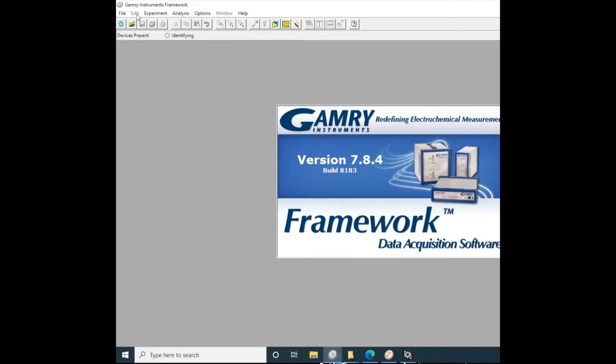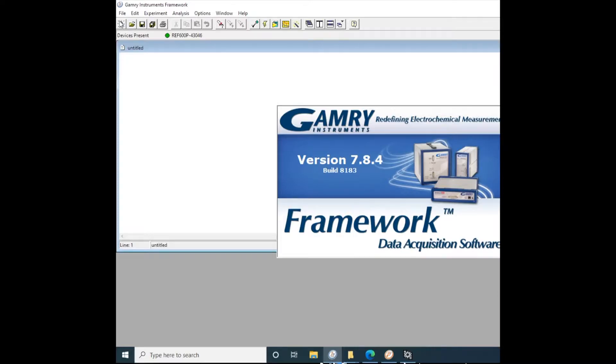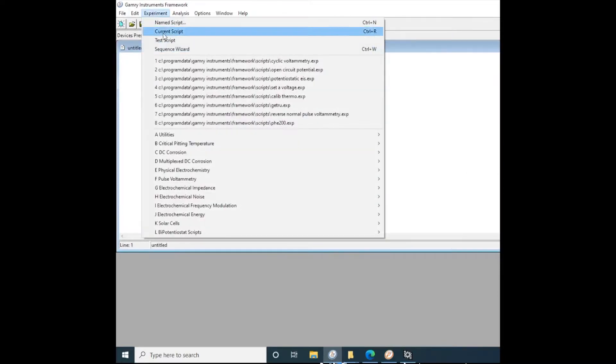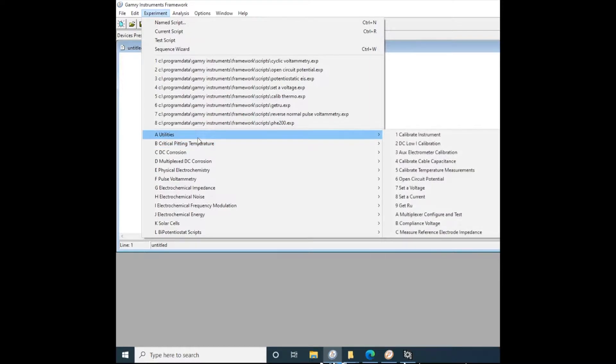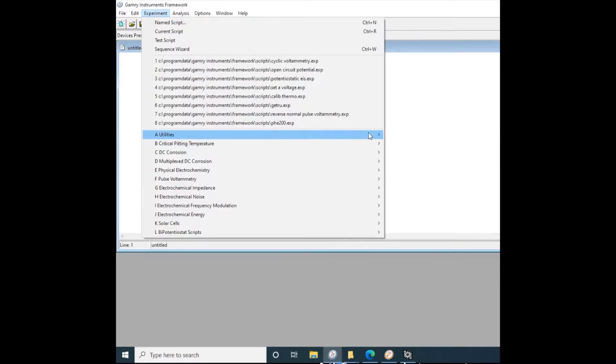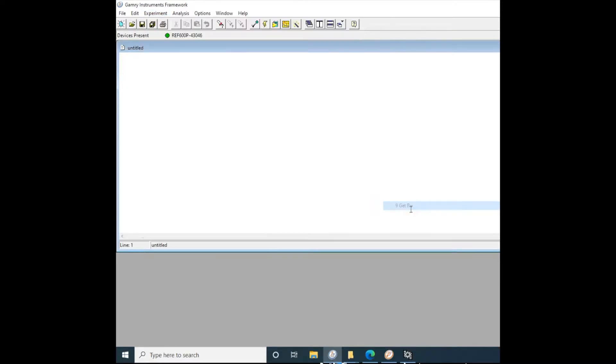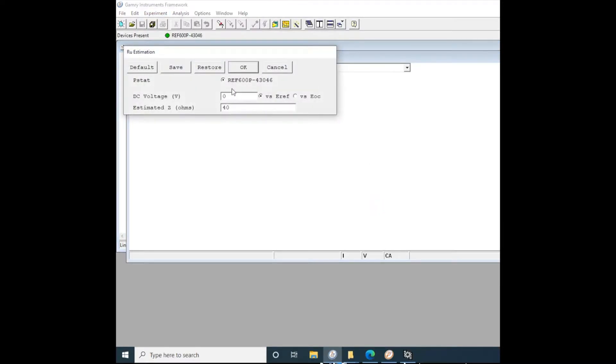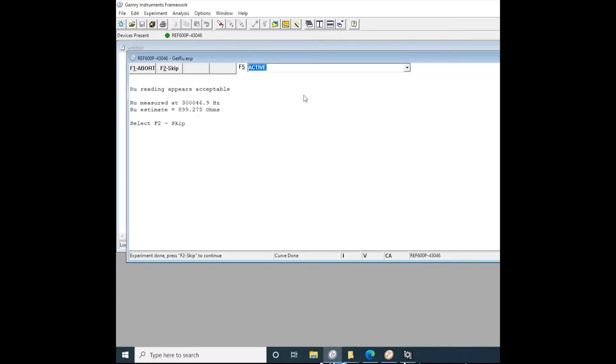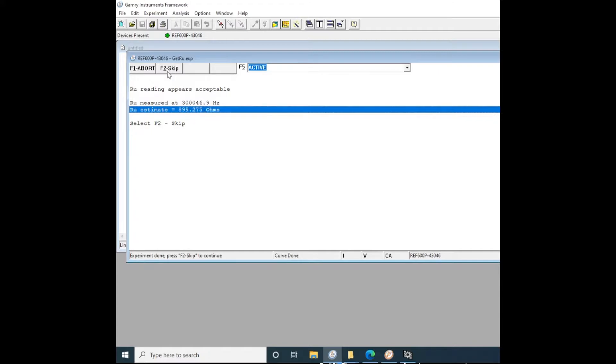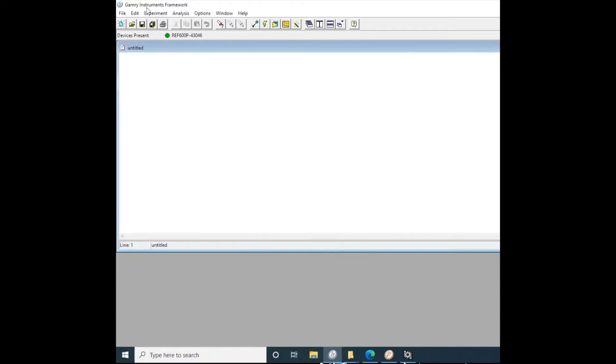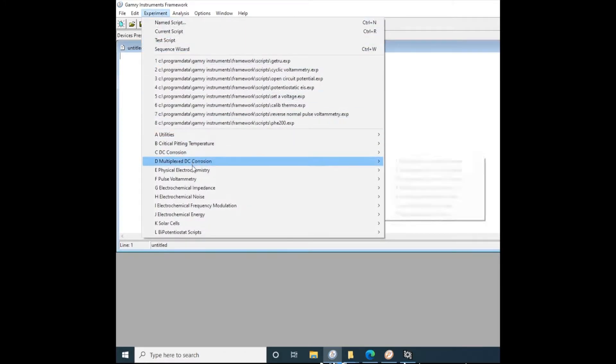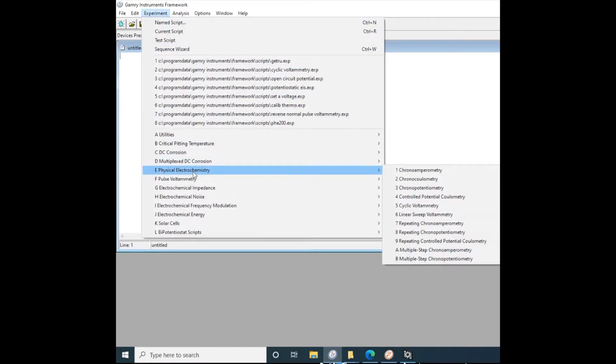Now we can jump over to the Gamry Framework software, pull up a new experiment, drop down the experiment menu, and we're going to start by going to utilities and getting our Ru, which is the impedance of the cell. It's a good way to check to make sure all of your electrodes are configured properly and to make sure that everything's plugged in right. If we're under a thousand ohms, we're probably good to go. Hit F2 to skip that experiment and move to the next one.